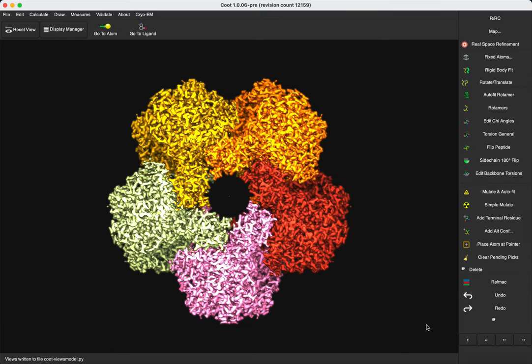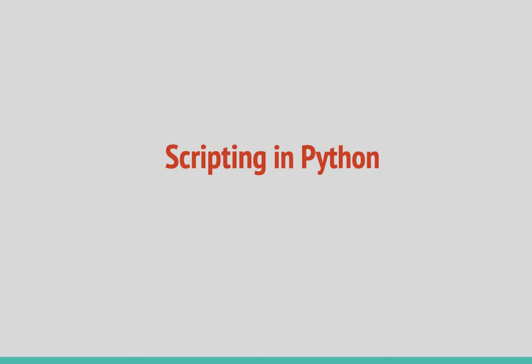We can also play with the Blur Strength. Finally, for now, it's not possible to make a screenshot in Coot. But we are trying to solve this issue. This is the end of the first part. Now we are going to move in the second part. So I will show you how to write a Python script by using the Coot function to make the same figure.